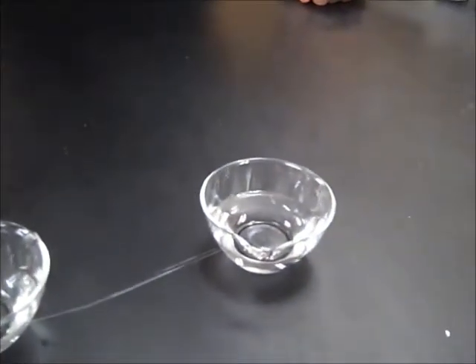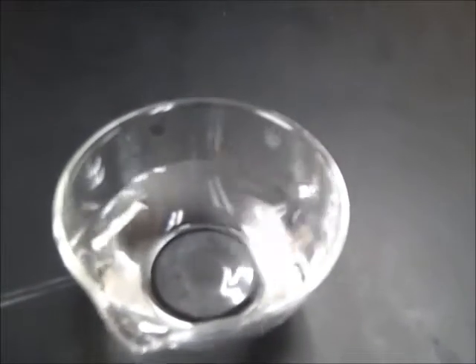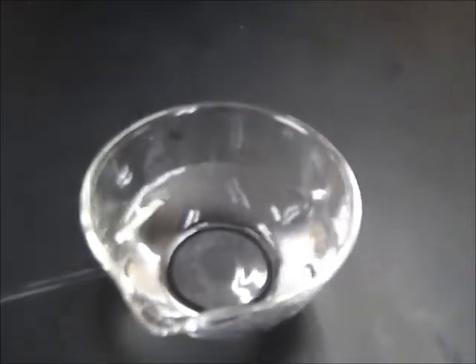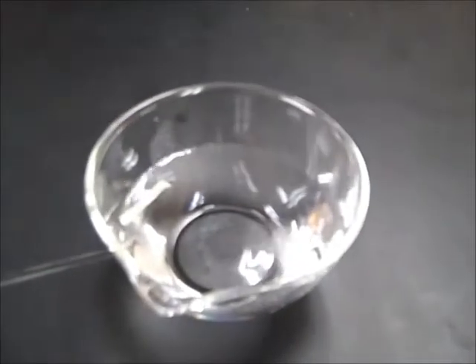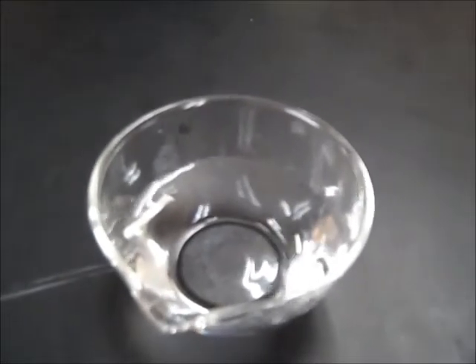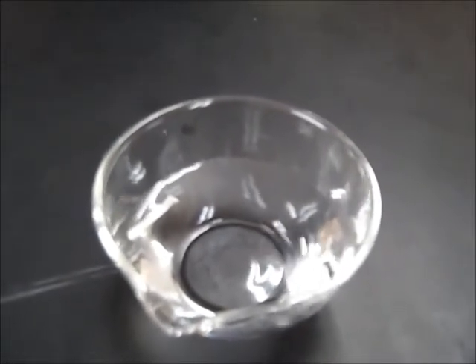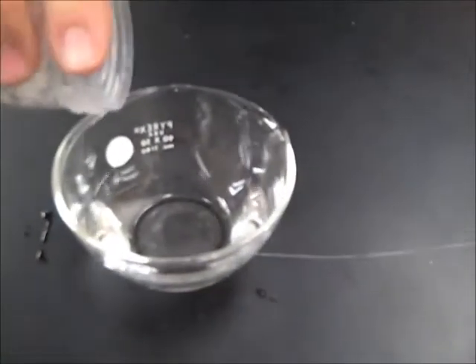That was the magnesium strip, yes. I'm going to put magnesium into water. Yep, like watching paint dry. Pretty boring. Go ahead and do the calcium. Dump it in my hand or dump it in? You can just put a little bit in there.